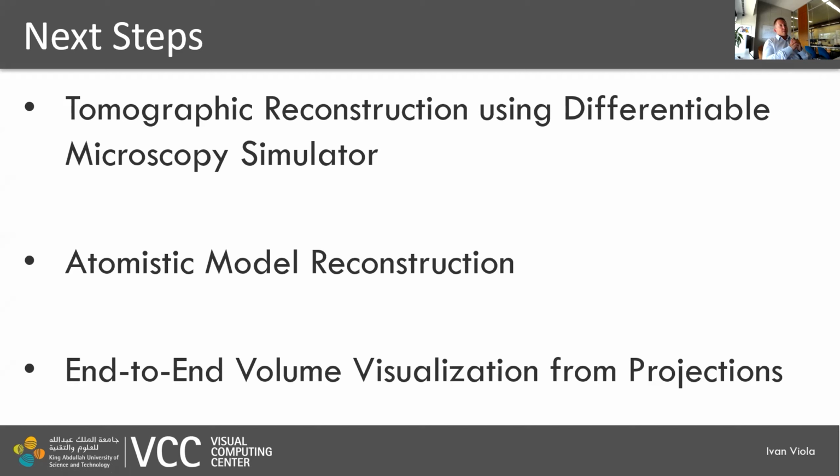That would be something we would like to try very soon. And provided that even works, we can have even higher ambitions. These are maybe a little more far-fetched goals, like perhaps reconstructing an atomistic model with proteins, as you have seen in the beginning of my presentation, out of these cryo-electron tomography projections.